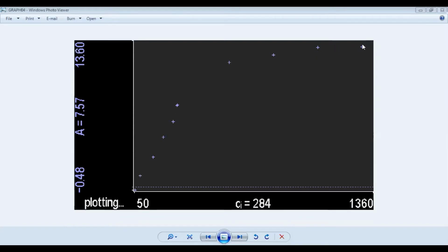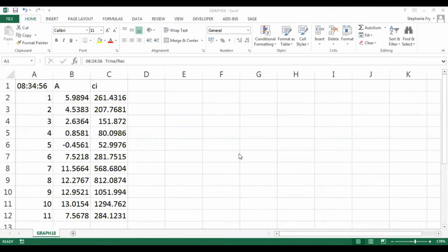This Excel spreadsheet formatted file is the result of pressing Export when plotting a graph, swiping down to reveal those extra options. Here we have 3 columns denoting the time that the graph was begun and the number of data points plotted.